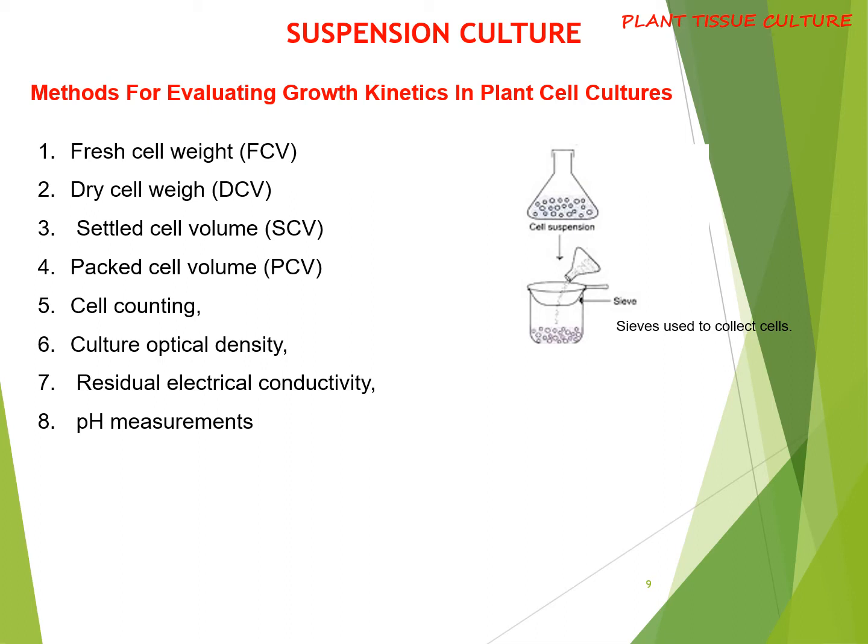The sedimentation volume is then noted. Every 30 minutes, the reading is taken and noted till the difference between the two consecutive readings is less than 5% difference.